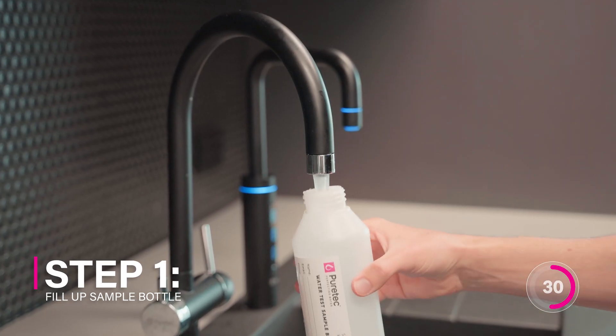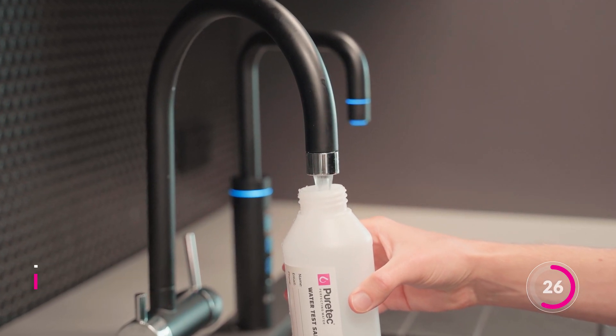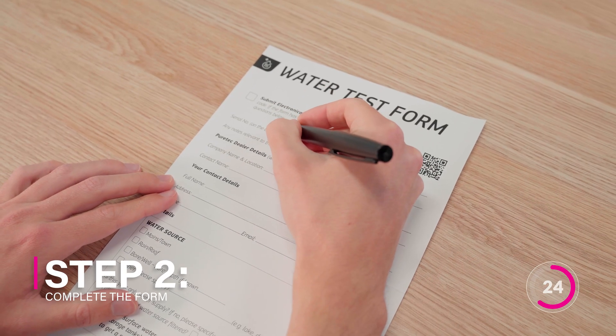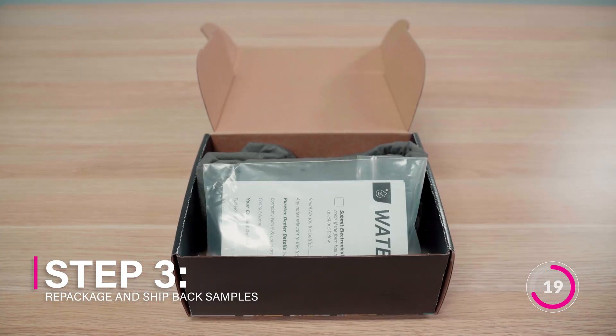Just follow these five easy steps. Step one, fill the sample bottle from your tap — for bore water, fill directly from the bore pump. Step two, complete the form. Step three, repackage everything in the provided shipping bag and ship it back to us.